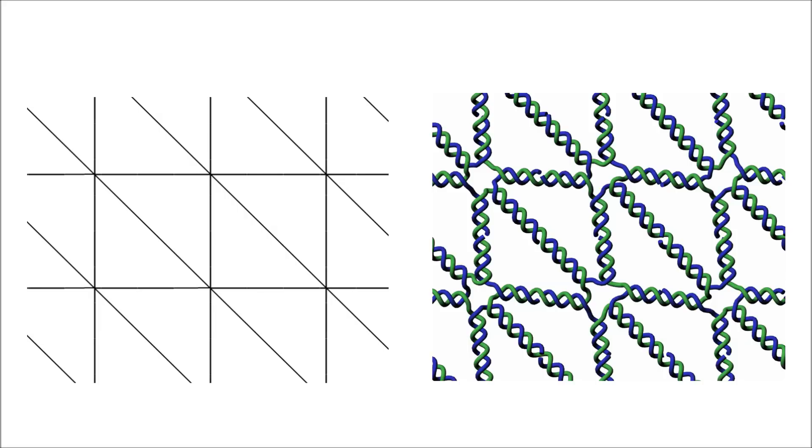I have to mention that we cannot change the routing of the staples, as this is fully determined by the scaffold routing. What we can change however, is the number and the position of staple breakpoints. So if we again look at the original mesh, and select the central vertical edge, and shorten it.